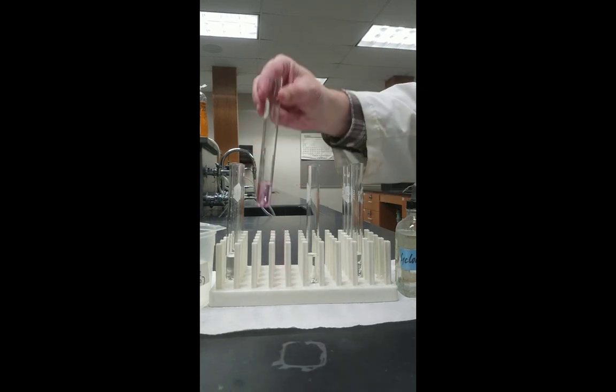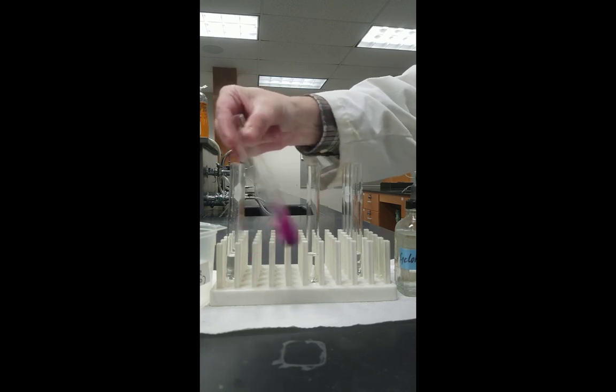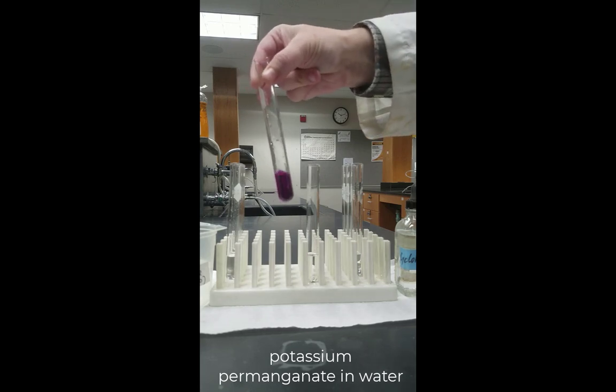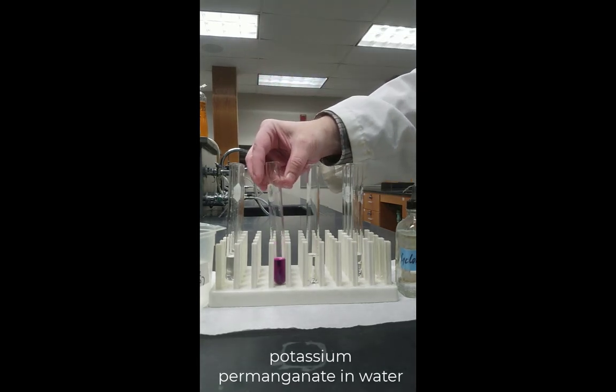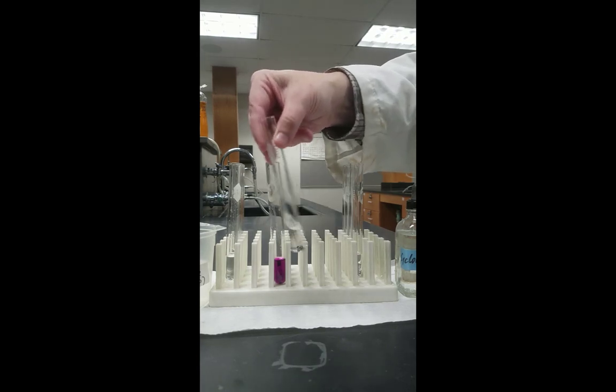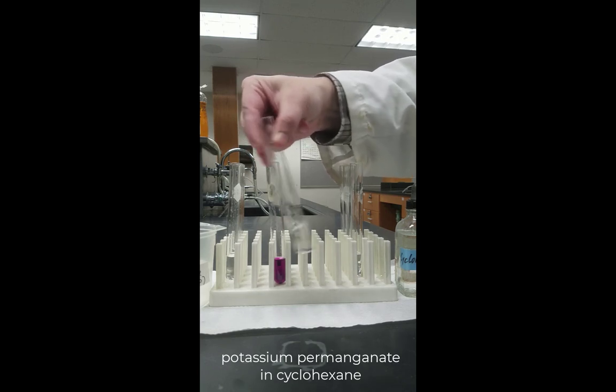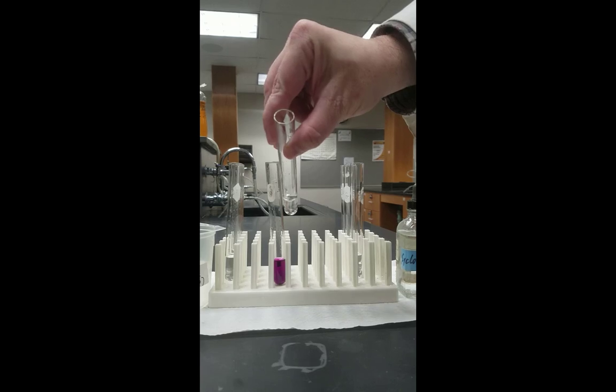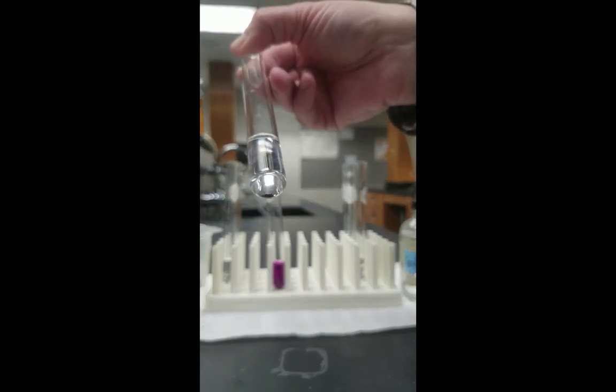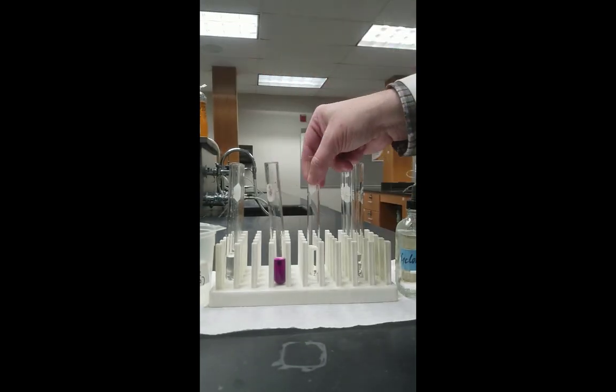Next, we're going to go ahead and shake each of the test tubes. So you'll notice that the water immediately takes on a very deep purple color, just like the solid itself. However, when we shake the test tube containing cyclohexane, no real change is observed. If we go ahead and we look at the bottom of the test tube, you'll notice that in fact, the solid potassium permanganate is still left in the bottom of the test tube.